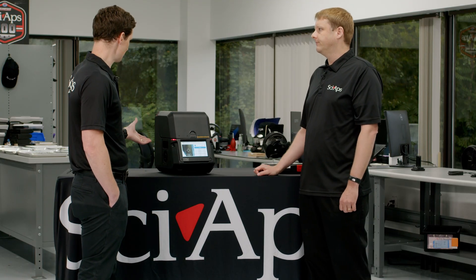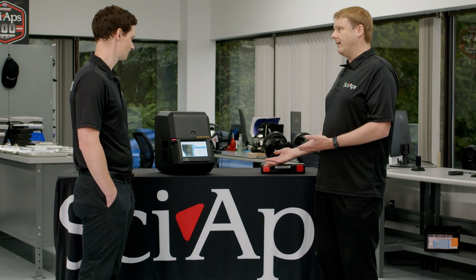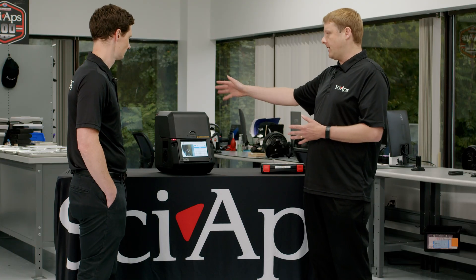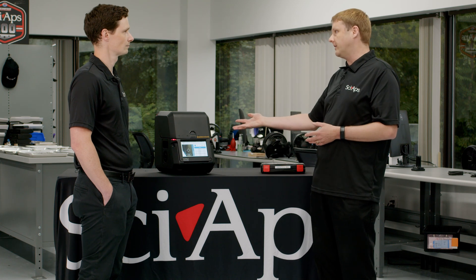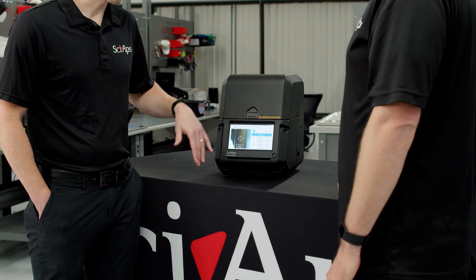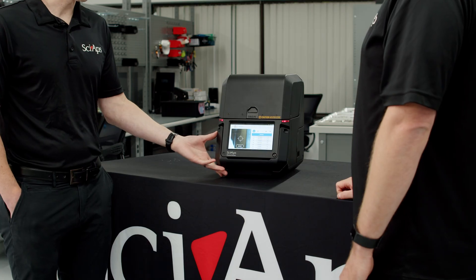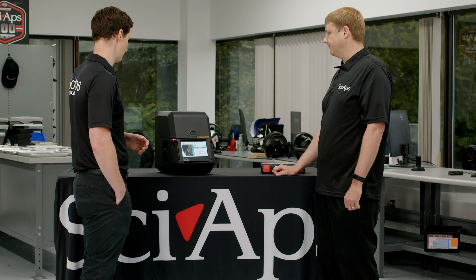And so why in a benchtop form like this? Because the tube in here goes up to 80 kilovolts, a lot higher energy than what you'd have in a handheld, so for safety reasons you want to use those in a shielded system. The system is fully shielded, has the lid that keeps the X-rays contained inside the sample chamber, and the lid is interlocked so you can't run it without the lid closed. It also runs on battery power — it comes with two batteries and you can run for several hours in the field without any power plugged in. It's got a handle so you can carry it around and easily transport it in and out of the field.